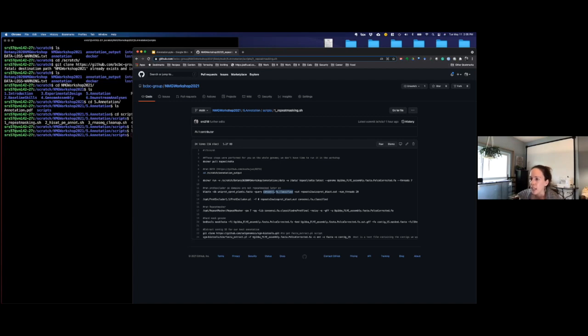So we find anything in our repeat set, this consensi.fa.classified, and we see if any of that matches known proteins. And if it does, we decide we don't want to mask that. So we remove that. So that's what prot excluder does. So once we have prot excluder output, then we can go on and run repeat masker.